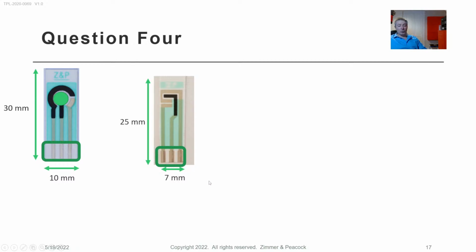That is important because it has become a bit of a standard now in the screen printed electrode world. Let's say that DropSens use it, the PalmSens potentiostats have this connector. Everyone's kind of recognized this is a good standard in which to lay out the connector pads.